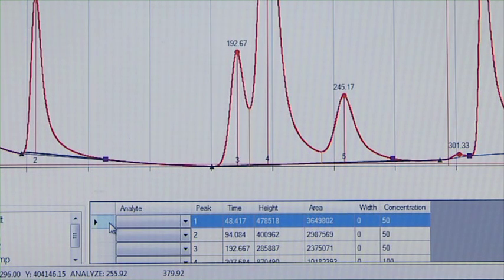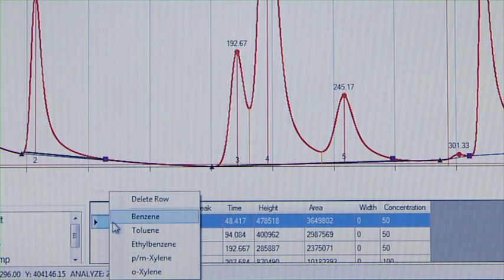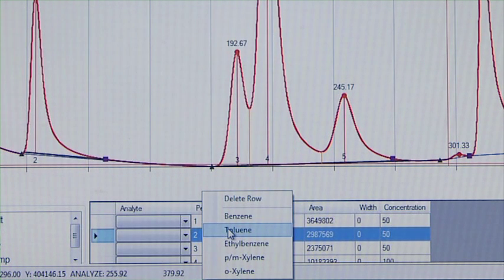Right-click on the row for peak number one and select Benzene. From earlier tests, we know that Benzene is the first peak to elute. Toluene is next, and so on.